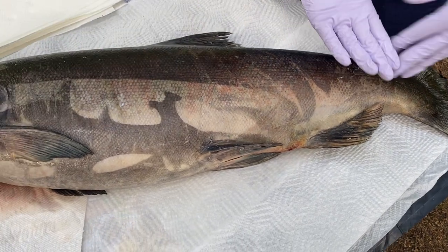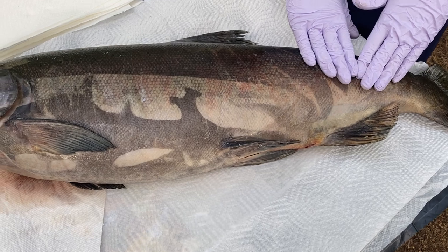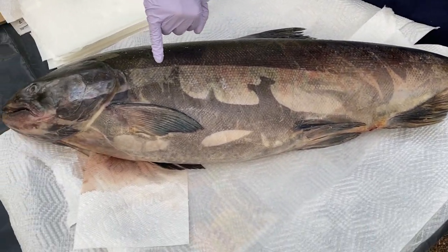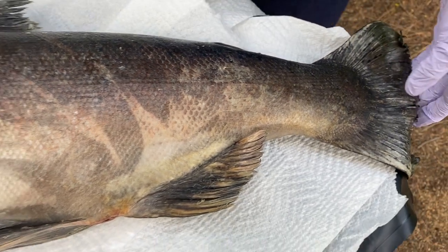It's also a nice protective layer that protects them from viruses and bacteria and diseases inside the water, so it keeps them healthy also. And then there's one more piece. I don't know if you guys can see this. It's a little bit hard, but there is a line that runs. It's usually where the color changes on the fish, and it runs all the way down. And that is called the lateral line.